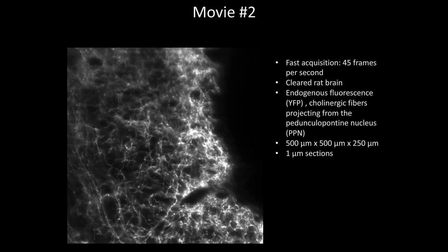I hope that you were able to see the fine processes that we were able to record. In that case, it was 4 tiles that were stitched using TeraStitcher.